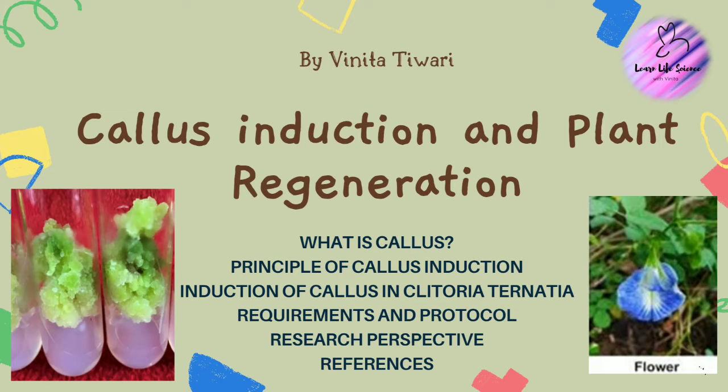So in this plant tissue culture concept, we will be studying callus induction and plant regeneration. The video is going to include the following contents. We are going to see what callus is, then the principle of callus induction, then I will give you a protocol that you can follow for the induction of callus in a plant, namely Clitoria ternatea. Then we will study some of the research perspectives, and finally I am going to mention the references which I have used for the preparation of the video, and which you can also use for your study purposes.